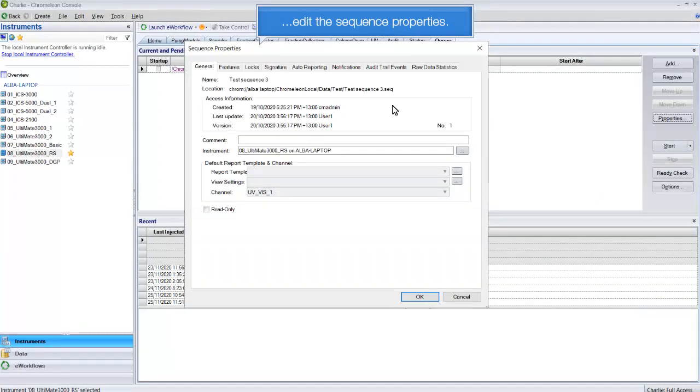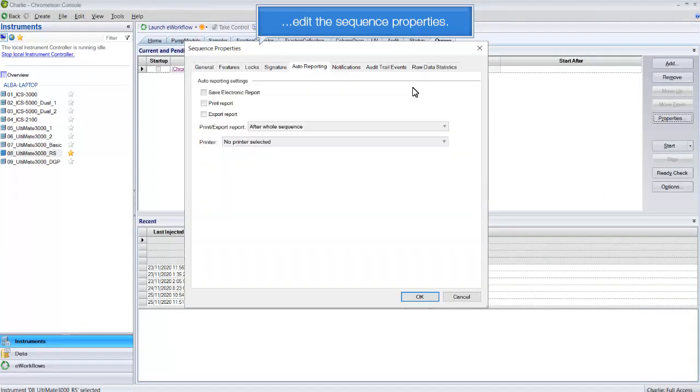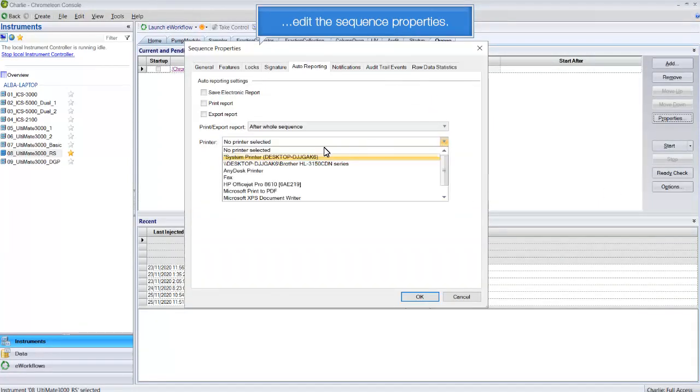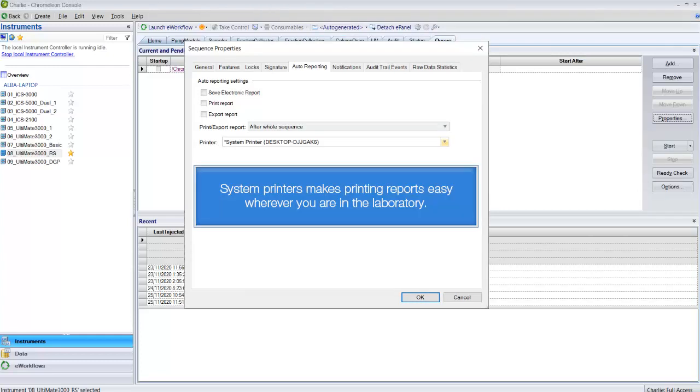Edit the sequence properties. System printers make printing reports easy, wherever you are in the laboratory.